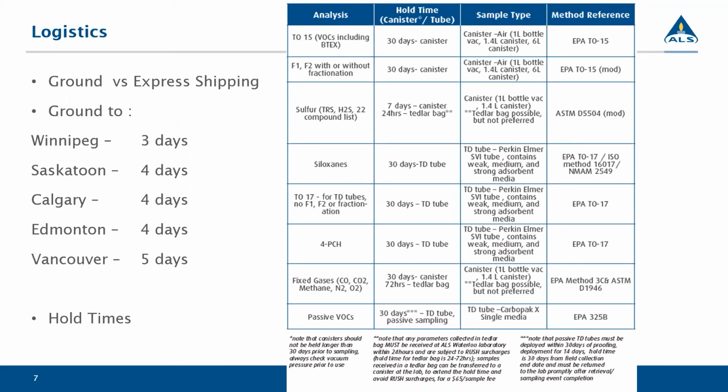So it doesn't mean that after 12 hours that sample stops taking air into the canister, just to keep that in mind. And this may seem obvious to most. It just means that it's set to collect and fill 1 can for 12 hours, but when they're connected with a duplicate sampler, they fill simultaneously, and it will take 24 to fill them both. So you're still getting a 24-hour sample. So hopefully that makes sense.